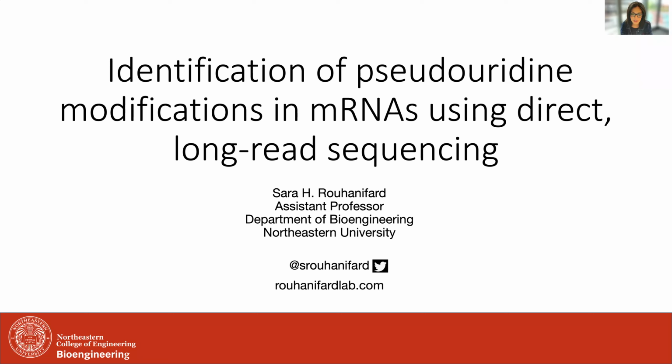I started my lab in January 2019, and I'm really excited to talk to you today about a direct RNA sequencing pipeline that we've been developing. So the title of my talk is Identification of Pseudouridine Modifications in mRNAs using direct long-read sequencing.